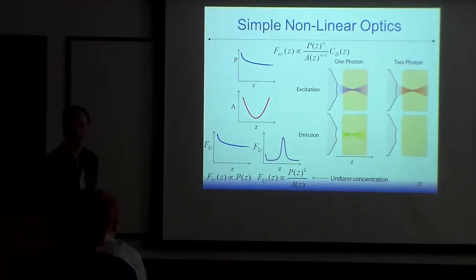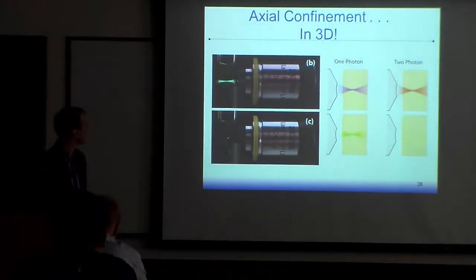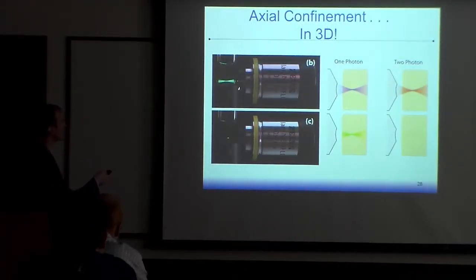But there's a spot there, and that's what you're looking at. And then here's actually an experimental demonstration. I've got white light coming in here, and you can see this little bow tie shape you would get from fluorescence. I put in some infrared light, so I can get a two photon absorption in some fluorescein dye, and I get a localized speck in 3D.